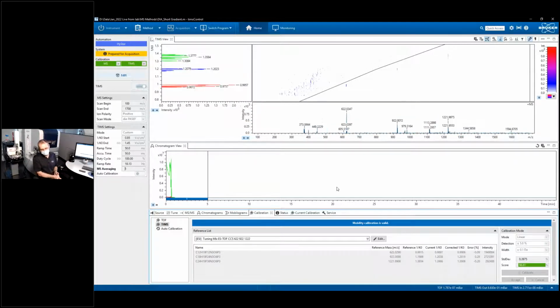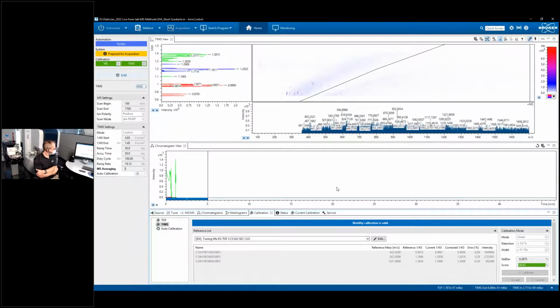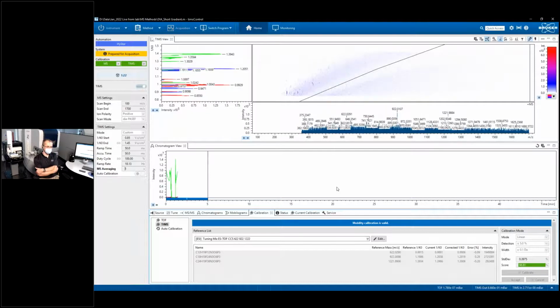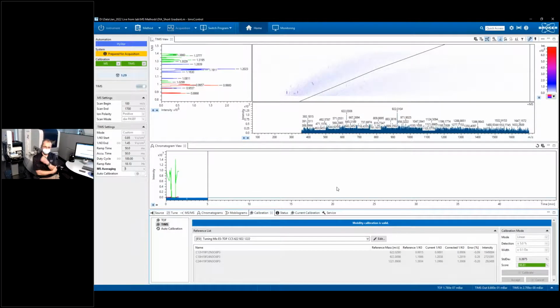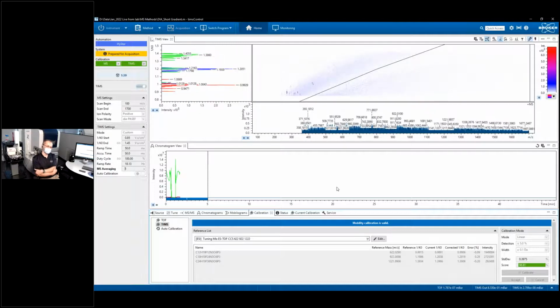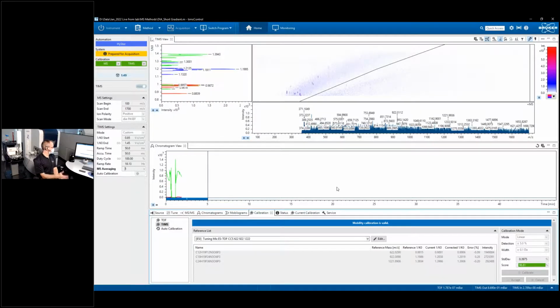So it really depends on what depth of coverage you need versus how many samples you have to analyze. And if you had to say about ID rates, DDA versus DIA, how many more IDs would you get under comparable conditions? If you look at the sample we ran today, 100 nanograms of K562, we're identifying about 5,000 proteins with DIA-NN. If you did the same thing in DDA mode, I'd expect around 3,000 to 3,500 protein groups. So you do get significantly more depth with dia-PASEF compared to DDA, even on the timsTOF.